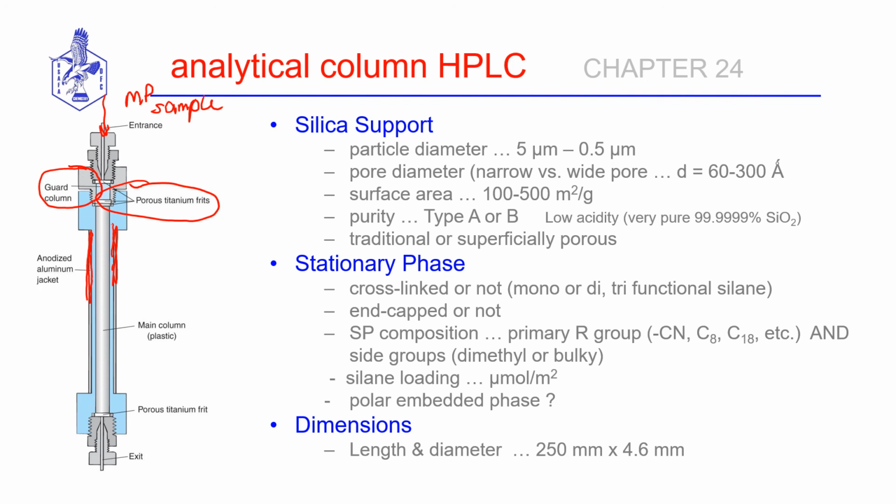So it's just a rigid container, and inside we have the packed silica particles in there. The industrial manufacturers go to extensive lengths to make sure that the packing is consistent. There are no big voids, pockets of air in there, so that we get ideal flow through. And then at the end, once again, we have another frit that's going to catch anything that might come through that's particulate in nature. And then once the eluent comes off the end of the column, it's going to go on to a detector.